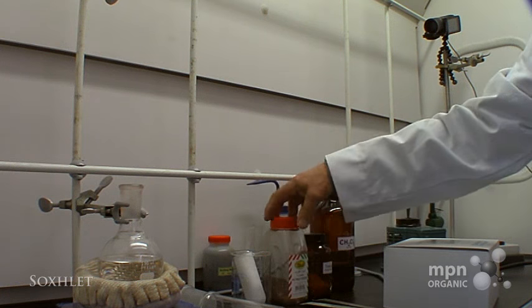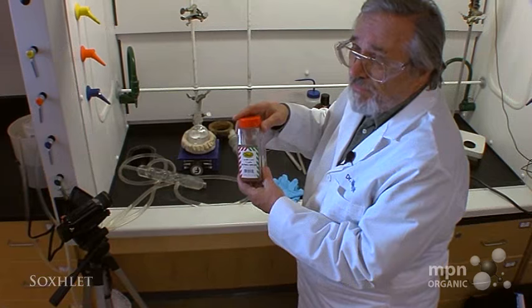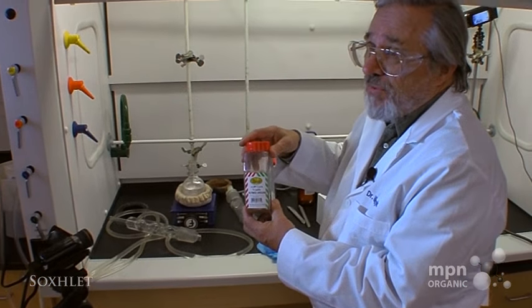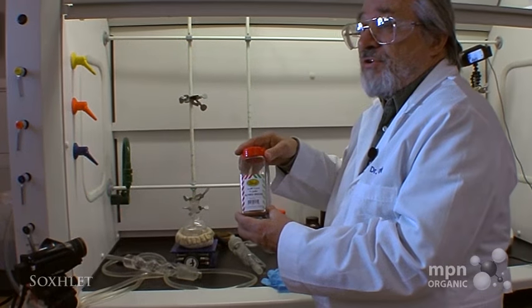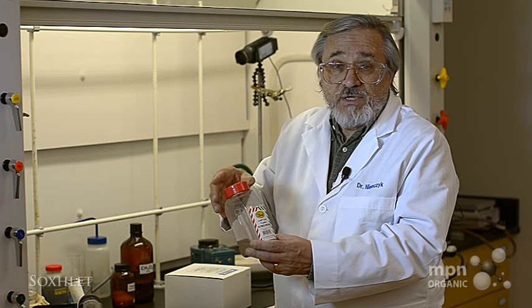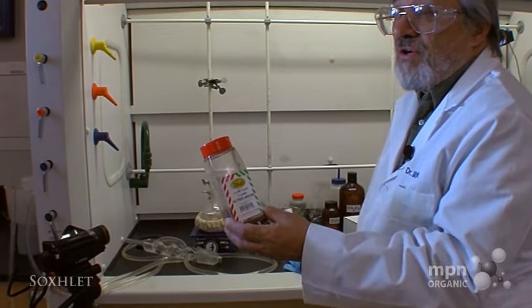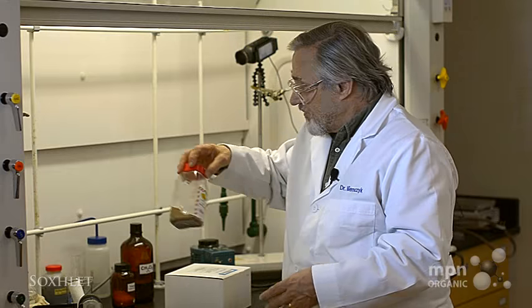We're going to extract a triglyceride called trimyristin from commercially available nutmeg. This is a spice that you can buy just about in any store — we bought this at the Village Market. This is a material that European countries sent explorers over to colonize places in the Far East where this was available, and it's a very important spice historically.